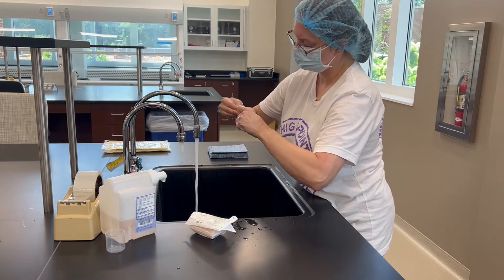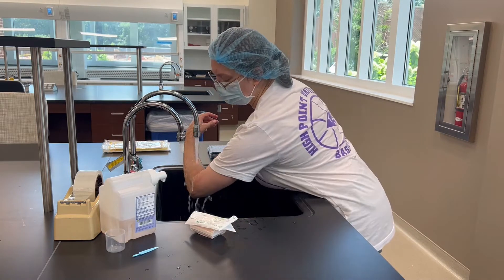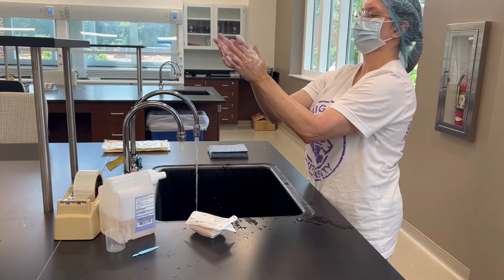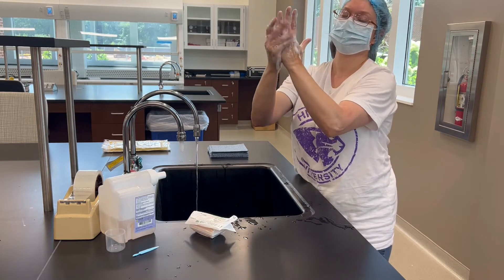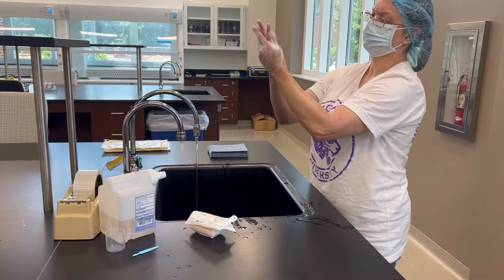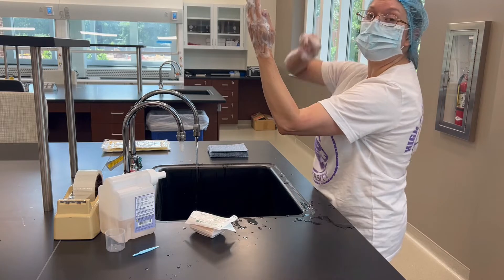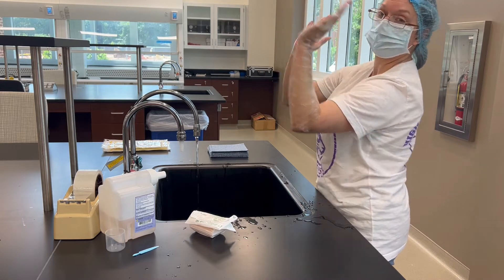The pick would go in the garbage. Now you're going to wet your hands from tip to elbow — 30 seconds. Get in between each finger and scrub really well. When it comes time to go down the arm, you do not want to go back up — one direction only.